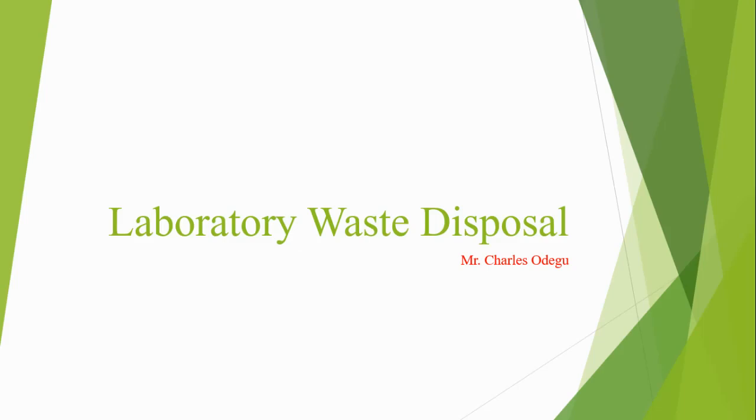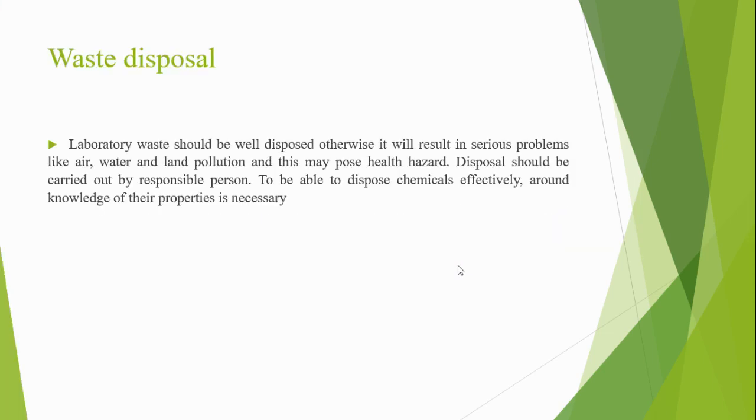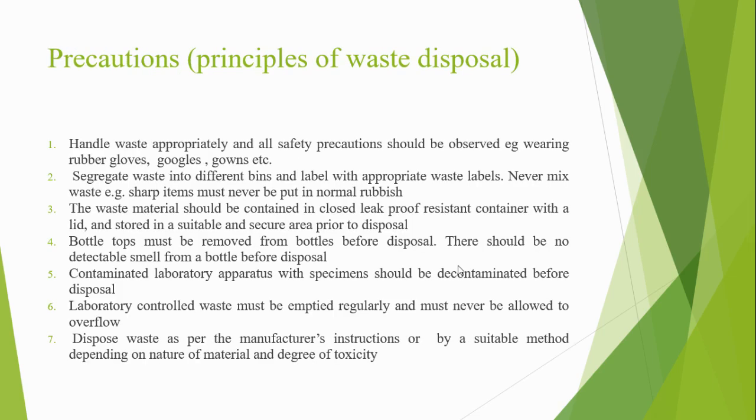So, I'm going to do a presentation about waste. I can define laboratory waste as any substance that has already been used properly. When we talk about types of waste disposal, we want to look at how we can dispose of laboratory waste. But before we look at those, let us look at types of laboratory waste.